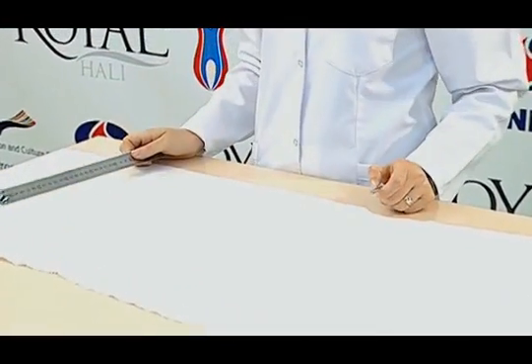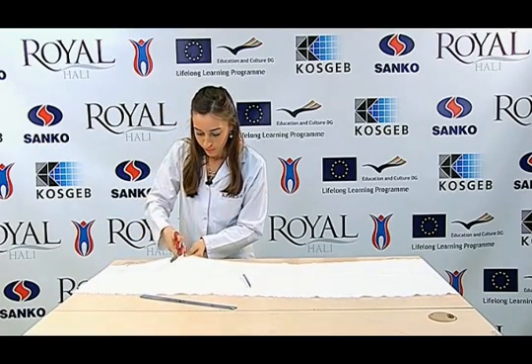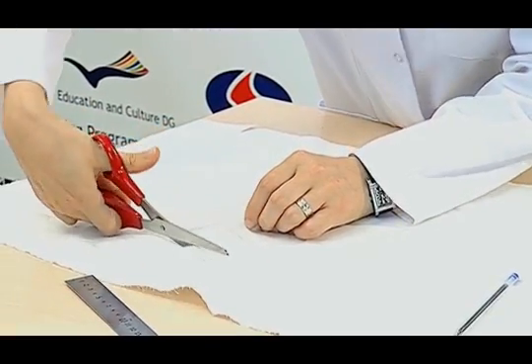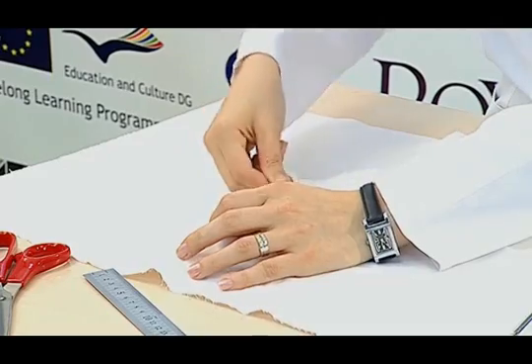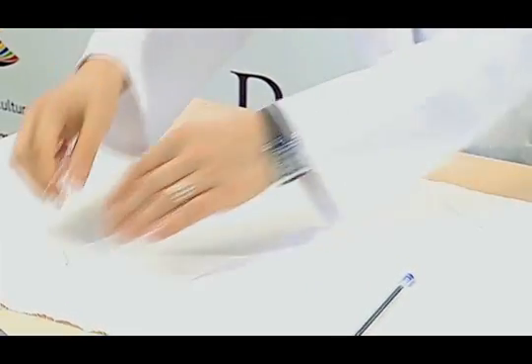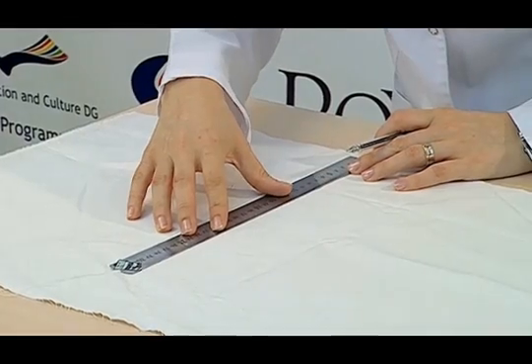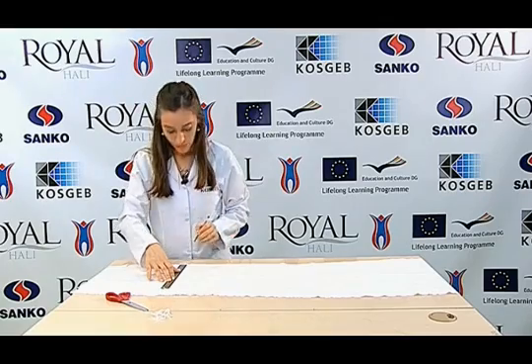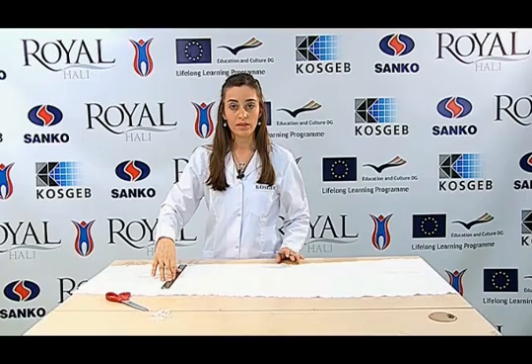From different parts of our fabric, five bands each for the warp and weft yarns must be drawn. The length of these bands should be appropriate for the test length — that is, the bands should be prepared longer than 20 cm since the test length is 20 cm. The width of the bands must be sufficient for the yarns to be taken out. An equal amount of yarns must be taken out of each band of five. Since the test requires 20 samples, four pieces of yarn from each band should be extracted.